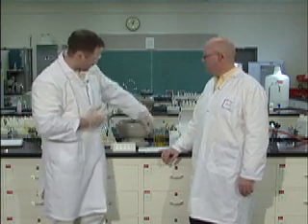Okay, 30. Actually, we really do have to wait a little bit. We have to wait 30. All right. But that's okay. Actually, it's probably better to centrifuge for about a minute, but we're going to wait 30 seconds for the purpose of the video.